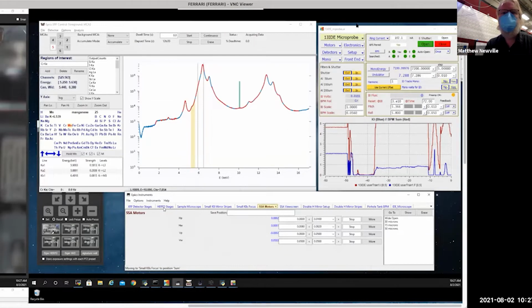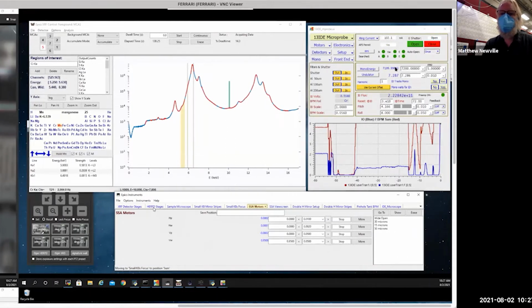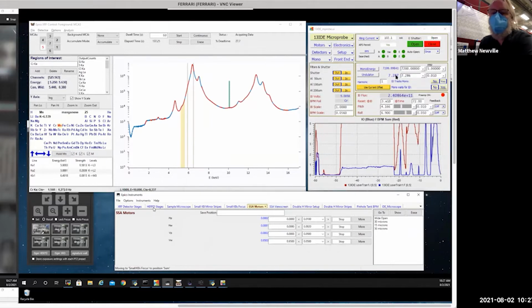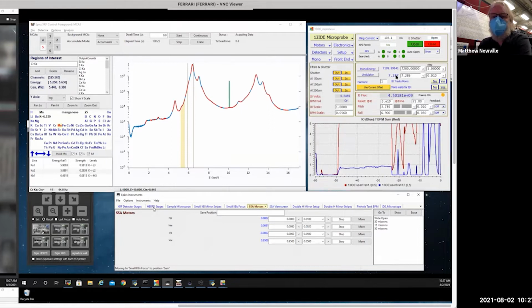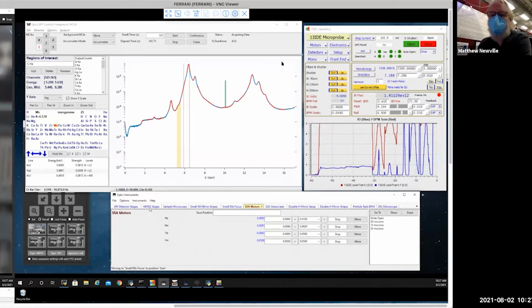I think you can see this. Okay, it's showing the energy is now 7200. There's an undulator energy. It's off a little bit, by about 1% from the monochromator energy. That's a well-understood effect, specific to the APS. That's how it is at the APS.